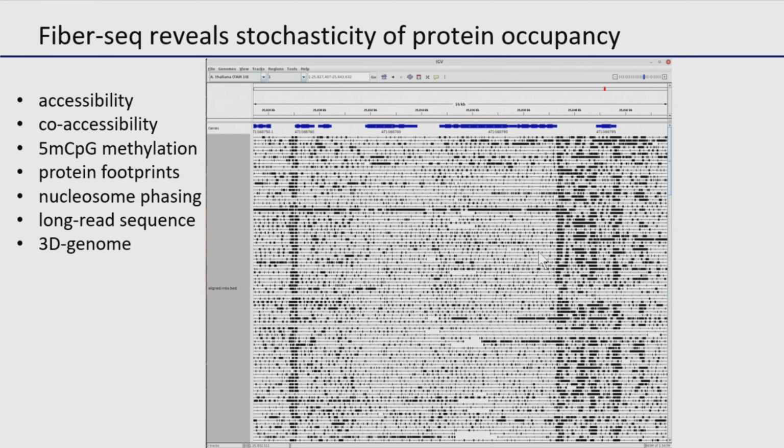And I want to point your attention right towards this promoter region, where you can see that literally every fiber is occupied by probably the core transcriptional machinery. The situation is much more nuanced, shall we say, complex. Favorite word in genome sciences. On the right side, you really see, for the first time, you get an idea that proteins are stochastically coming off and on.